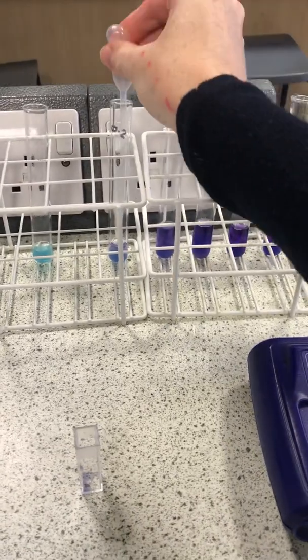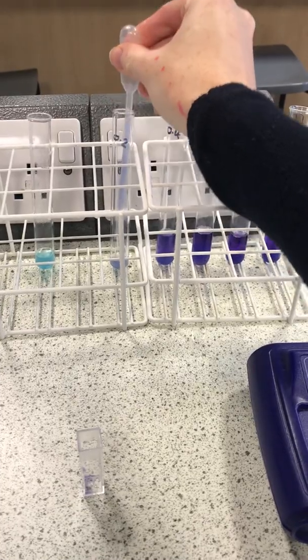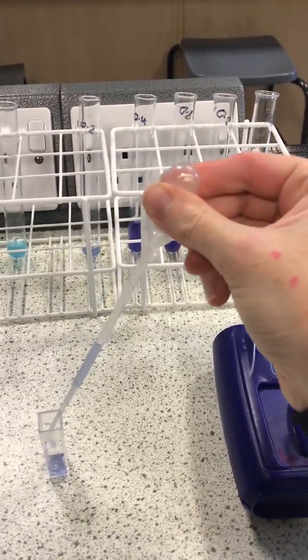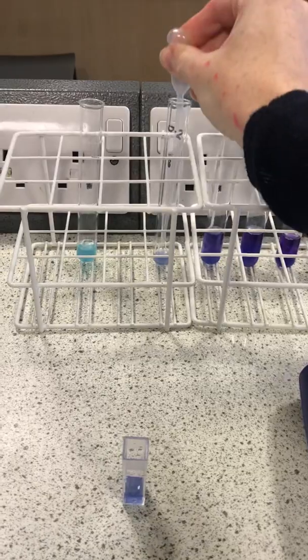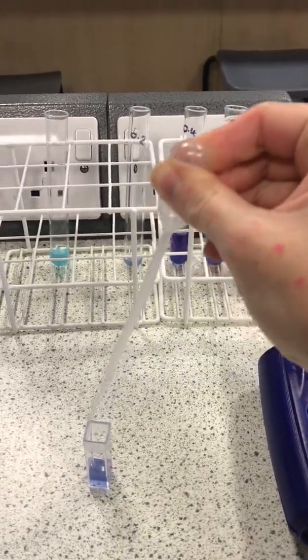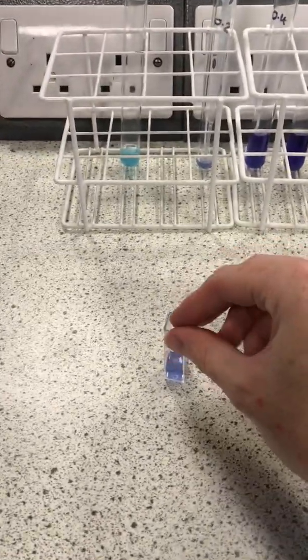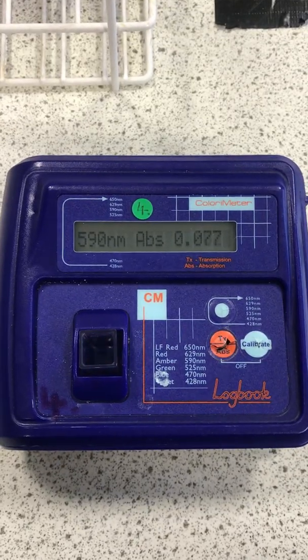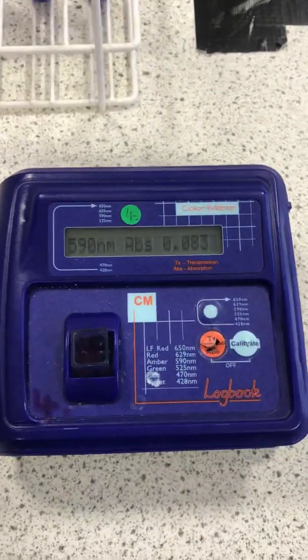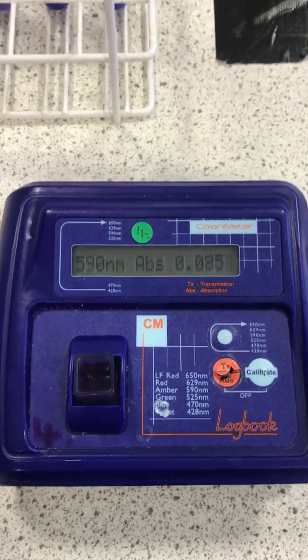So we'll transfer some of the 0.2, giving it a good mix, into the next cuvette. Okay, so now we can take this one out and transfer this one in. Okay, now we can see here we're getting a higher reading, and that agrees with the data that we've generated by eye. This is definitely a more intense colour.